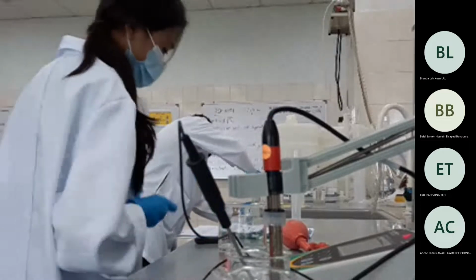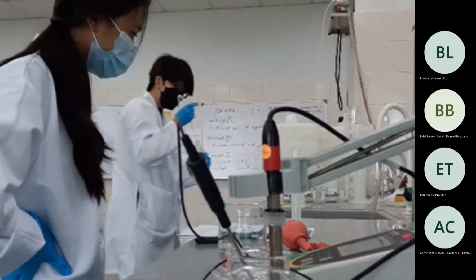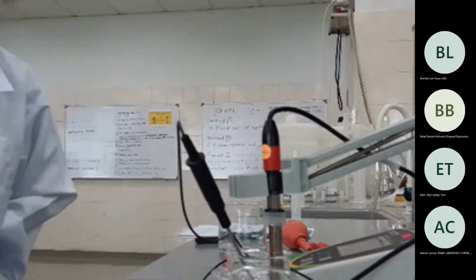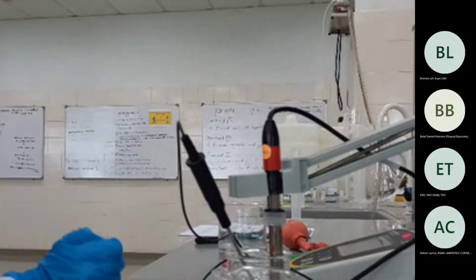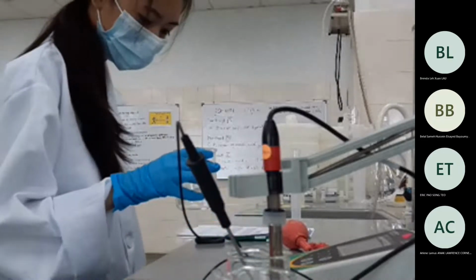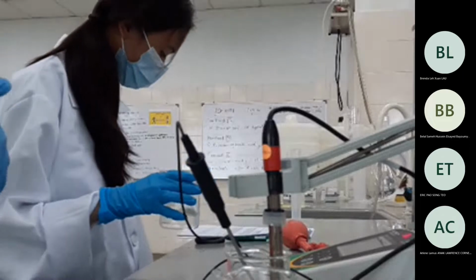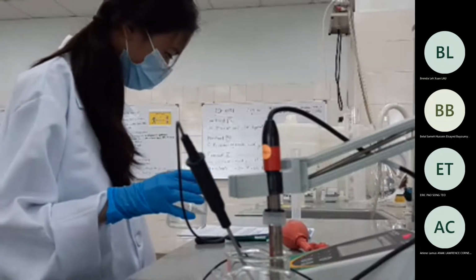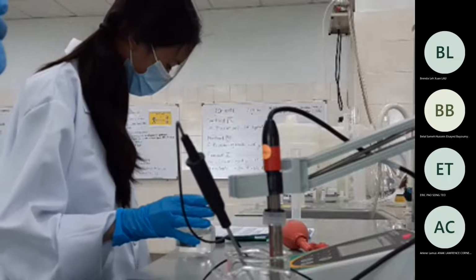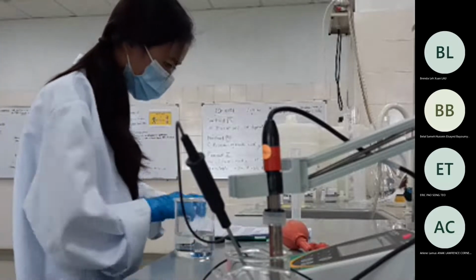So you have to prepare 1, 2, 3, 4, and label them. So which one are you taking now?